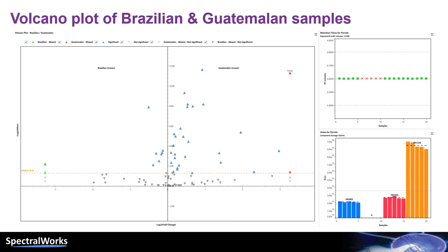Nevertheless, the PCA score plot shows there is a difference between Brazil and Guatemalan beans. To further explore this, we can use the Volcano plot in Analyzer Pro XD.